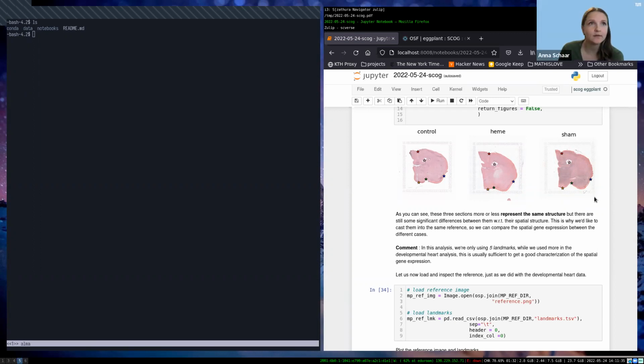Nice. The next question, and so far as I see the last one in Slido, would be if you have 2 tissue sections, one wild type and the other one a mutant, if you could still compare them even if they don't differ significantly in their gene expression. Yeah, sure. I mean, the comparison is always possible to make.